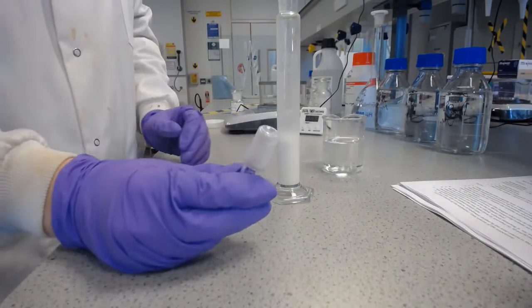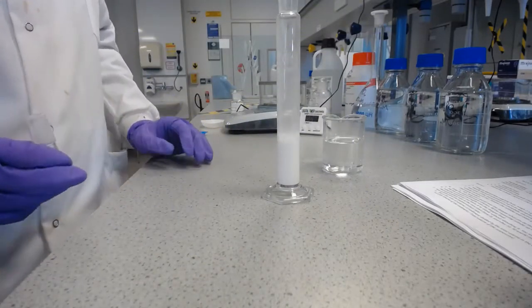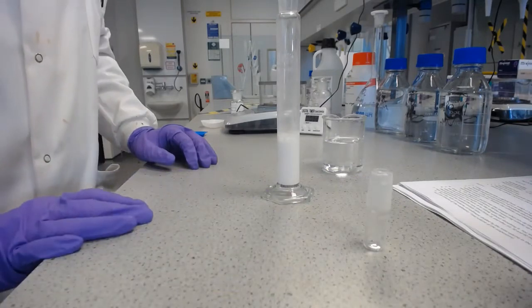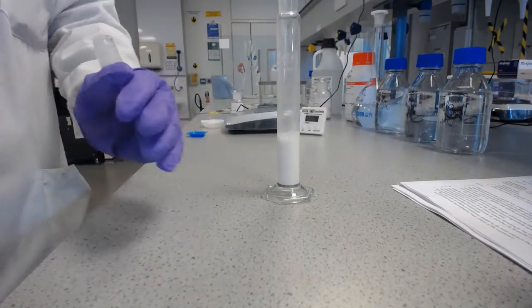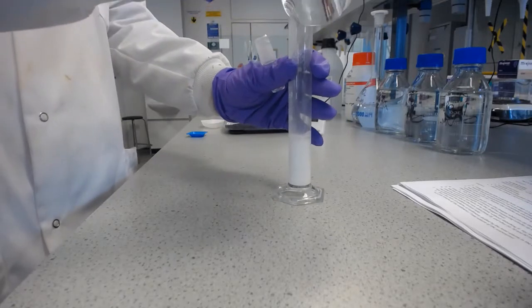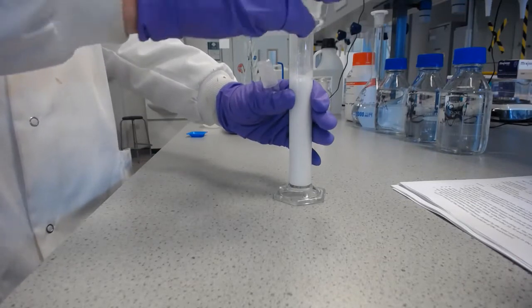Now that's got stuff on it and it's going to go back in there. So good lab practice is either to keep it in my hand, which I will probably do, but if you're unable to do that, is to make sure it stays upright, or you put it on something that is clean already. So I'm probably just going to keep that between my thumb and forefinger whilst I hold this, and then accurately top it up to 50 millilitres.